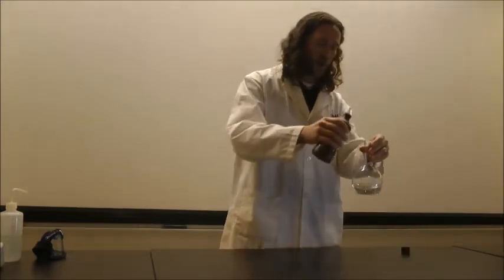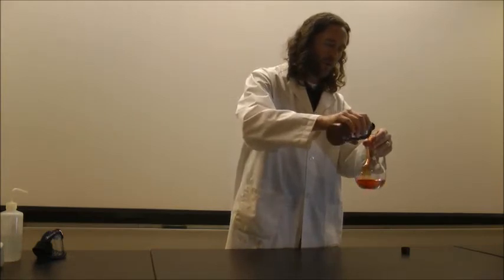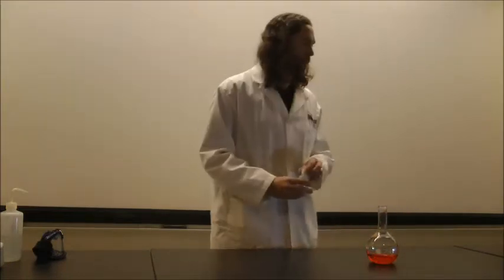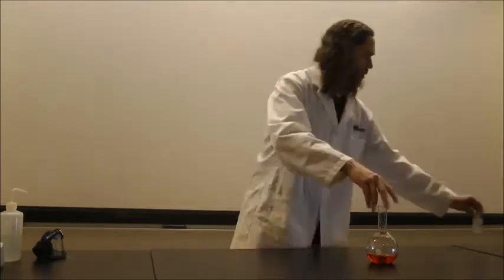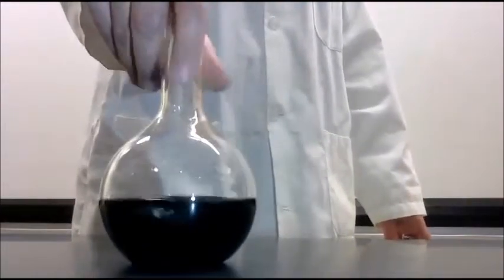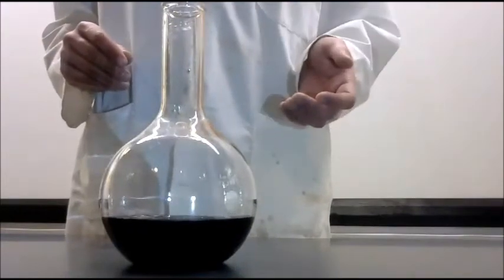So here I have some water, and I'm going to put in a little bit of indicator, and the indicator helps us see something about what the pH, or that acidity or basicity, of a solution is. So I'm going to make this solution just a little bit basic. There we go. I've turned our solution basic, and so now it is a blue color. I made it more basic by putting in sodium hydroxide.